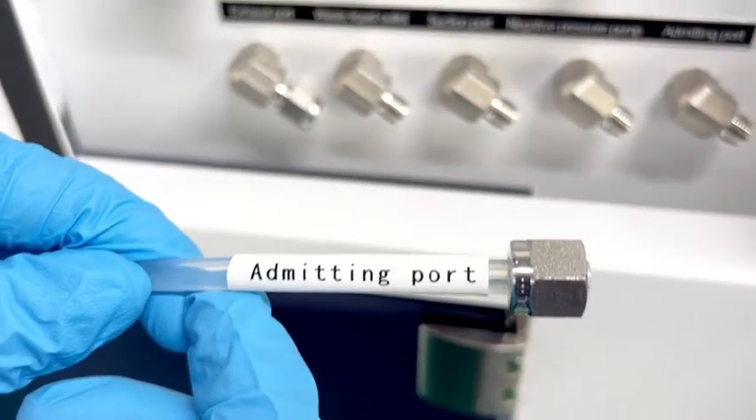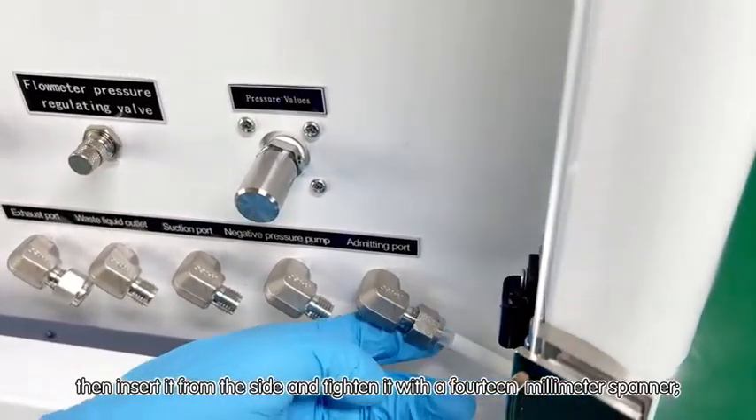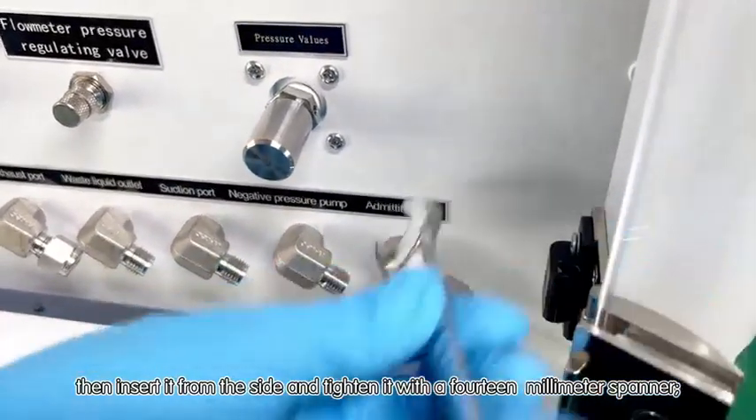Installation of the air intake, step five. Find the first fitting on the right air intake, then insert it from the side and tighten it with a 14mm spanner.